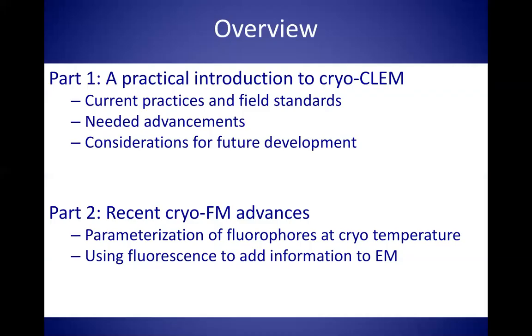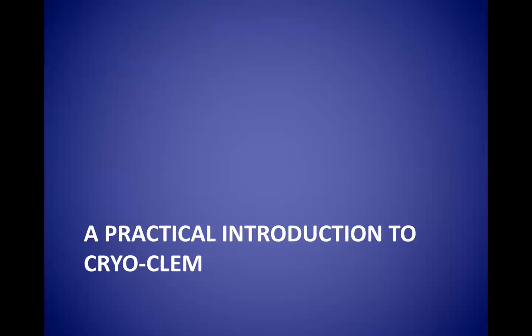So a brief overview of how the talk will go. I'll begin with a practical introduction to Cryo-CLEM, and then I'll move on to recent advances in the field that I've been involved with, particularly parameterization of fluorophores at cryo temperature, and using fluorescence to add new information to the electron micrographs in cases where that would have otherwise not been possible. So beginning with the introduction.